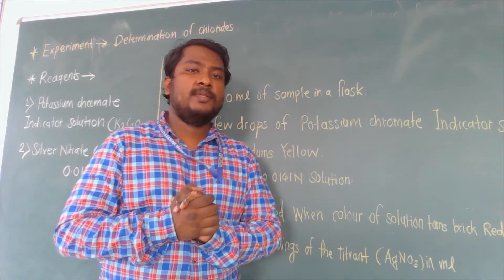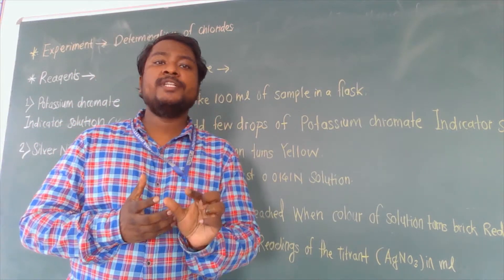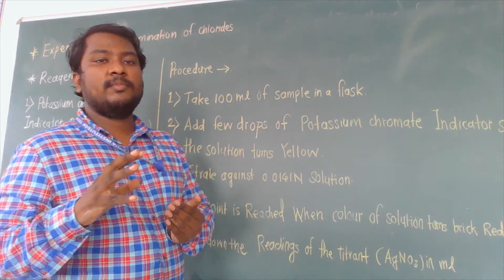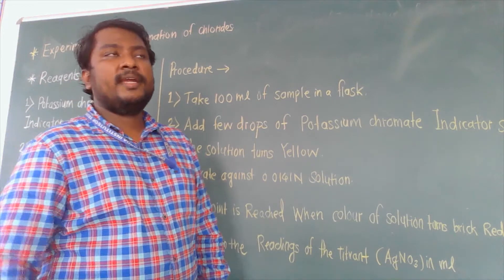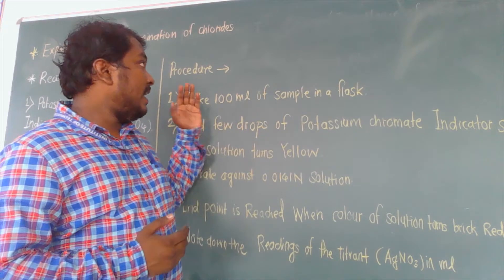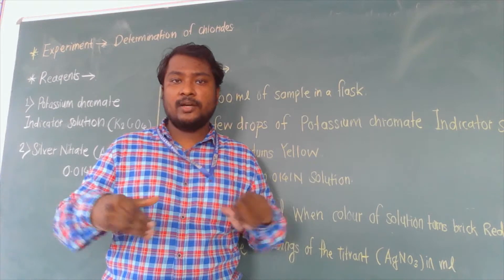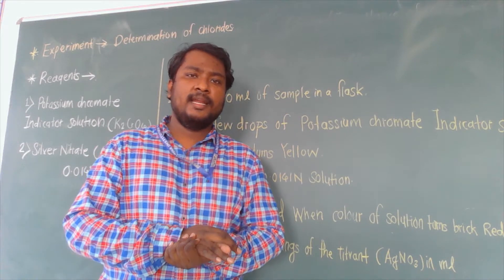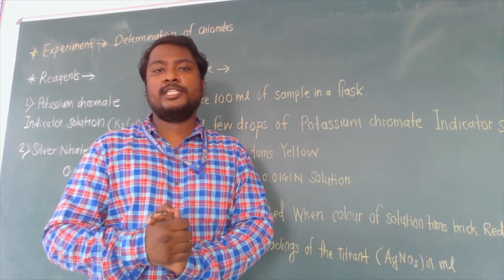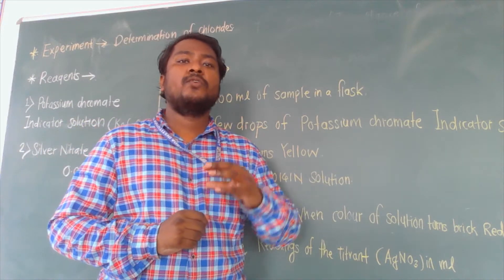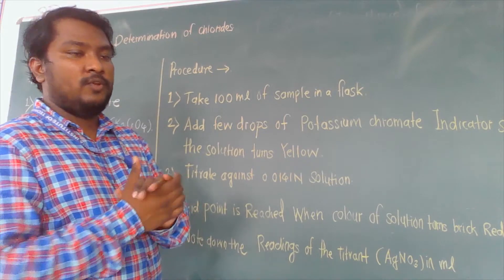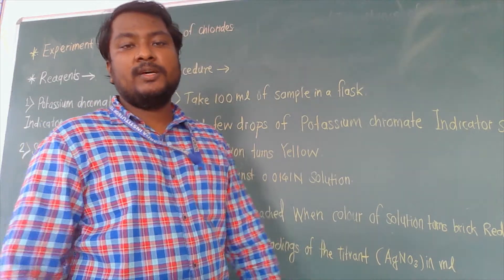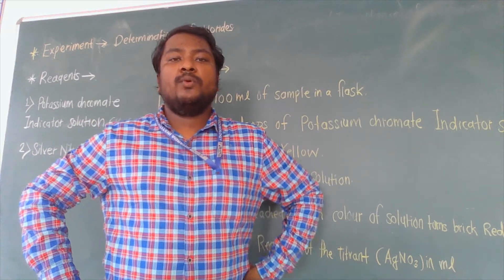Note down the burette reading at which you stop the titration — that is where you obtained the end point. At the end point, all the chloride ions present in the corresponding sample have reacted with the titrant in the presence of the potassium chromate indicator, and the brick red color remains. The color will not change further because all chloride ions in the 100 ml sample have been detected. The final step is to note down the readings of the titrant, AgNO3, in ml, and perform the further calculation.